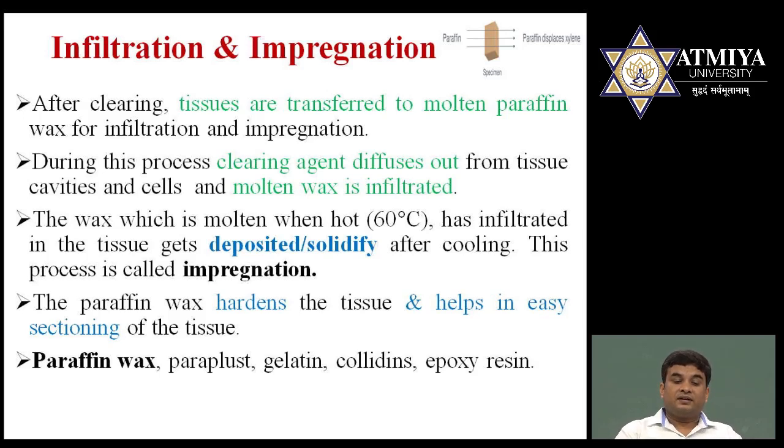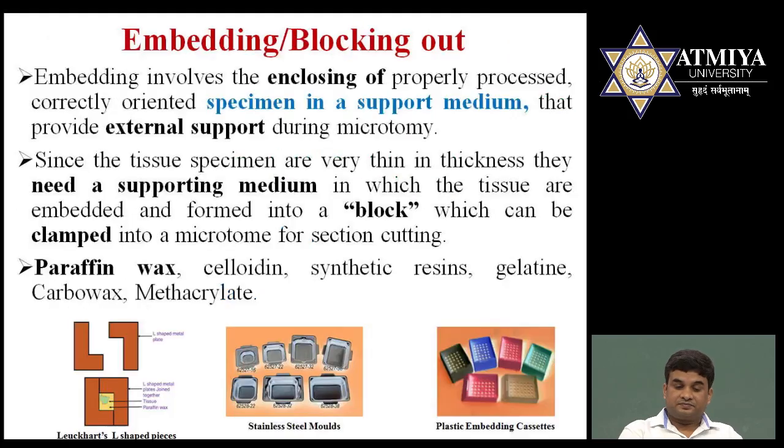This impregnated tissue gets support, which helps in sectioning during microtomy. Mostly paraffin is used as the infiltration reagent.